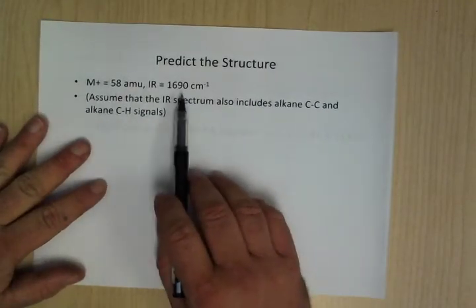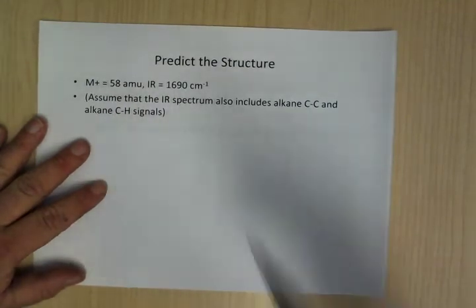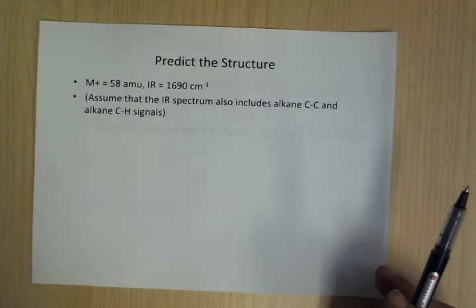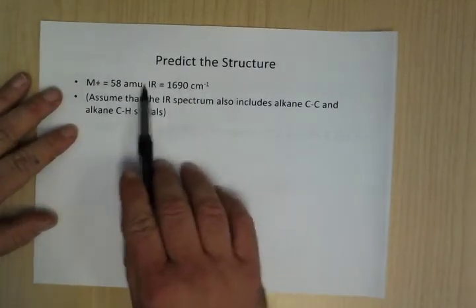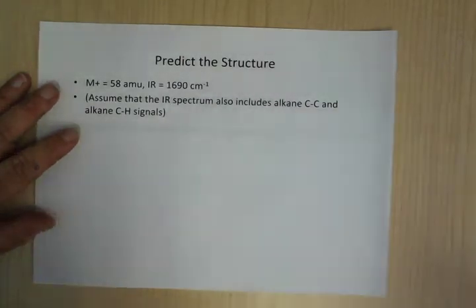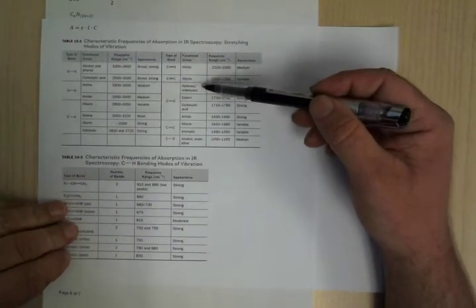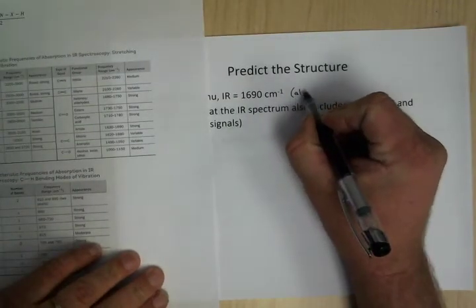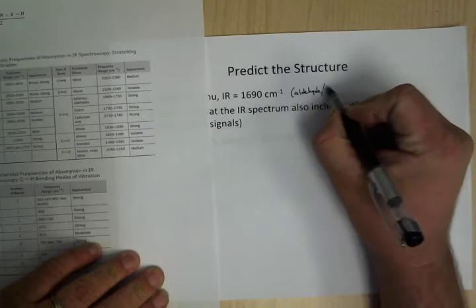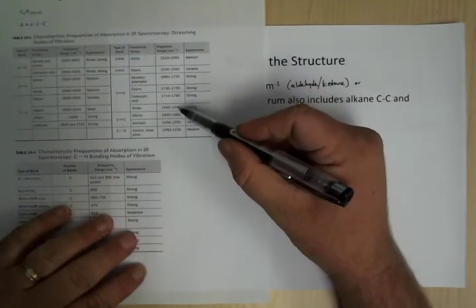Okay, so here we go. For this one, we're given a mass and an IR, and we need to predict the structure. Usually what you want to do is start with the IR information. So you look at your chart and figure out that this is right around 1700, which is usually the C double bond O. So it could either be an aldehyde or ketone, or it could be an amide.